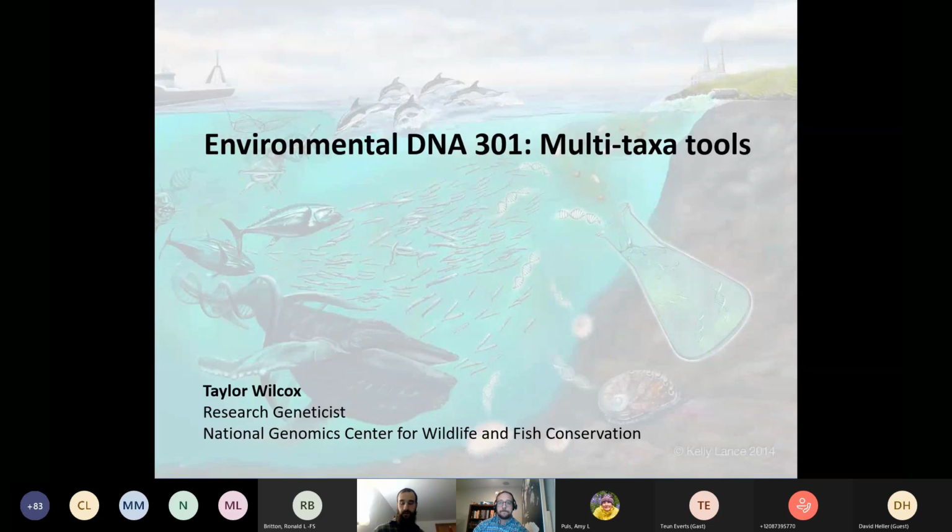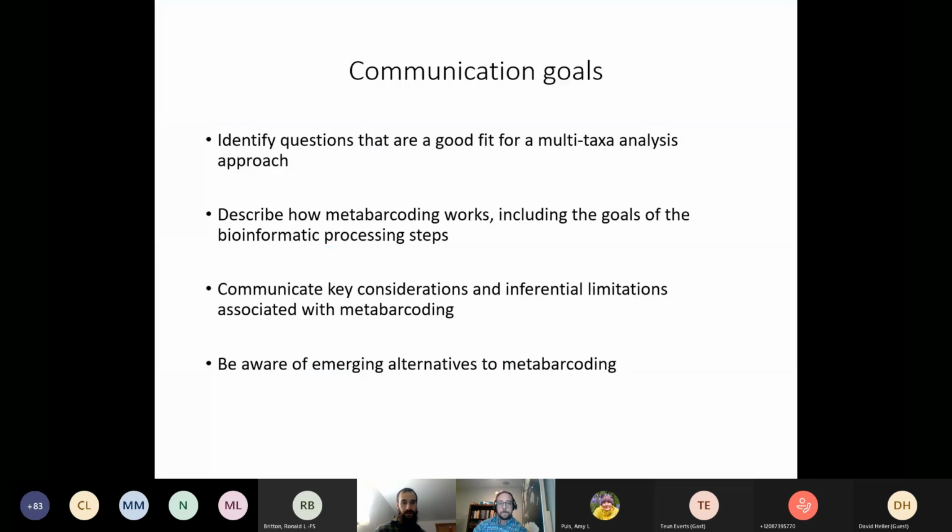Yeah, so I'm excited to be giving the webinar today. I just want to outline some communication goals so you know what you're getting yourself into. I would like people who are listening to be able to identify questions that are a good fit for a multi-taxa analysis approach. We're talking about environmental DNA sampling. To be able to describe how metabarcoding works, including the goals of the bioinformatics steps, at a very general level. To be able to communicate some of the key considerations and inferential limitations associated with metabarcoding. Again, this emphasis on metabarcoding is because it's really the dominant multi-taxa eDNA analysis approach currently used. But then also be aware of some emerging alternatives to metabarcoding. They're either just starting to be applied or on the horizon. So my goal is to get to these 4 points.